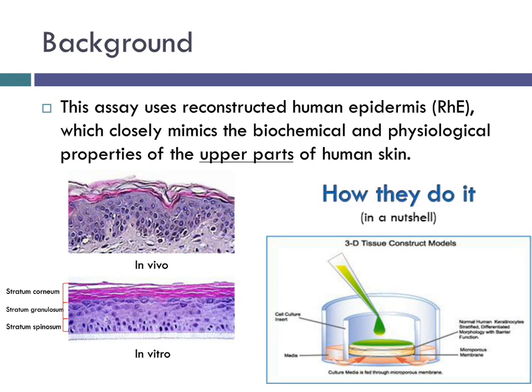And so they have the same concepts of structure of an in vivo skin, excuse me, that we can now test on to see the response that we would likely see in an animal. We can now see on these skins. And so this is the kind of test platform we use. We're still doing a topical exposure, but this topical exposure is on these reconstructed human epidermises.